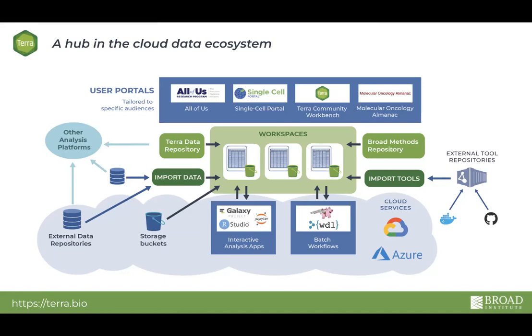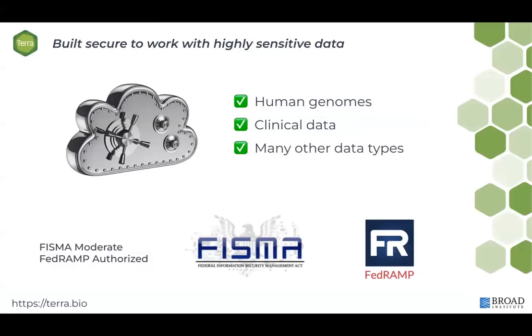What we'll be demonstrating in this workshop will be based on the Google Cloud Platform, but we've also recently launched Terra on Azure, which is very exciting. So you all get to be on the ground floor in that respect.